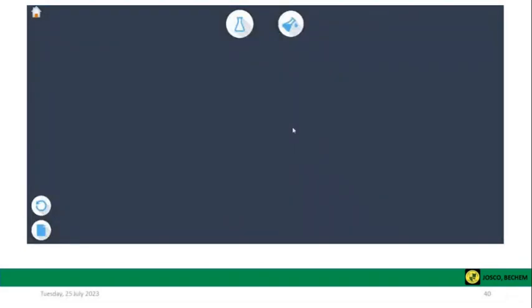Now, let us watch this video to sum up the test that we have talked about in terms of the bromine test. Aim: to identify the unsaturation present in an organic compound by bromine water test.